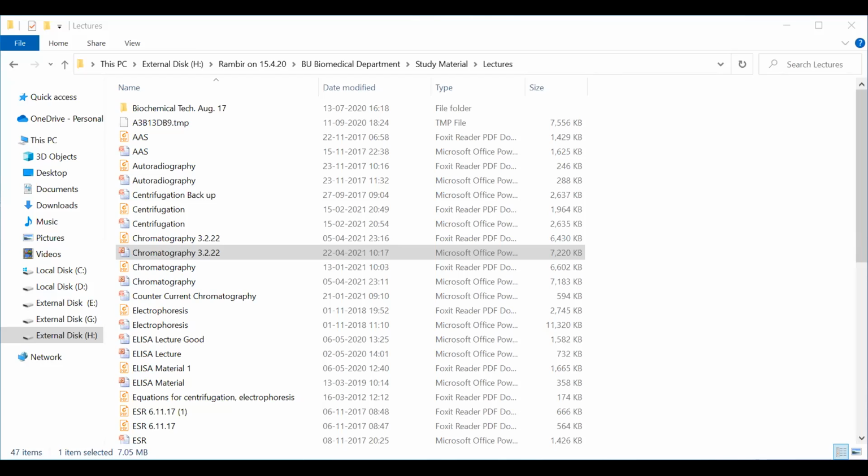Yes, Samra, have you heard about the word adsorption chromatography? Adsorption, have you heard about the word adsorption? Yes, sir. What is that? Sir, adsorption means the attaining of certain liquids on the surface of the phase. For example, the common example is that if we dip a chalk in the ink, then it is considered as adsorbed, not the absorbed one.